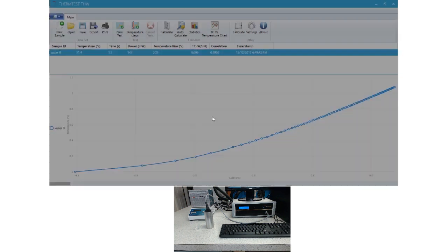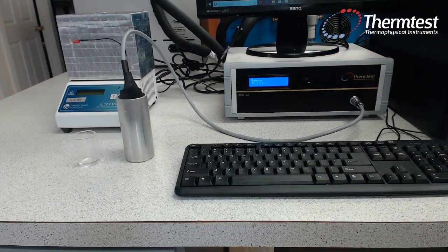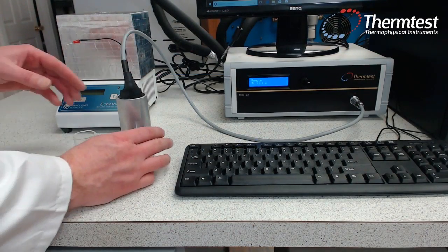For measuring solids and insulation type materials, the test time can be slightly longer, depending on the dimension and surface of the solid insulation and powder type materials. Once your measurement is complete, your thermal conductivity is displayed on the screen, as well as the temperature of the data and your sample ID. So let's switch back to the camera so I can reverse disassemble the sample setup to give you an idea of how that is accomplished.